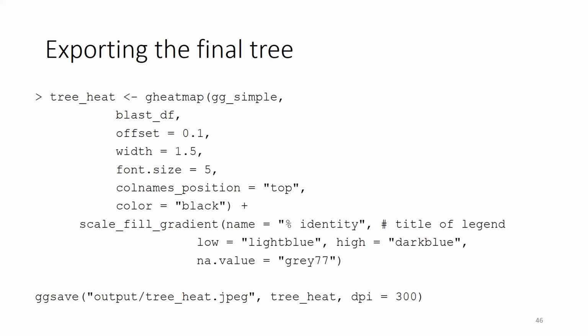If you have a very large tree that you can only view by using the zoom window, you can save that by right-clicking, but usually it might not have as nice of resolution. So you can specify the height and width, and it'll save as a very large tree, but it will maintain the DPI. And maybe this isn't great advice, but you can open it in Paint and scale it down, and it'll keep the DPI for publication purposes, which is nice.